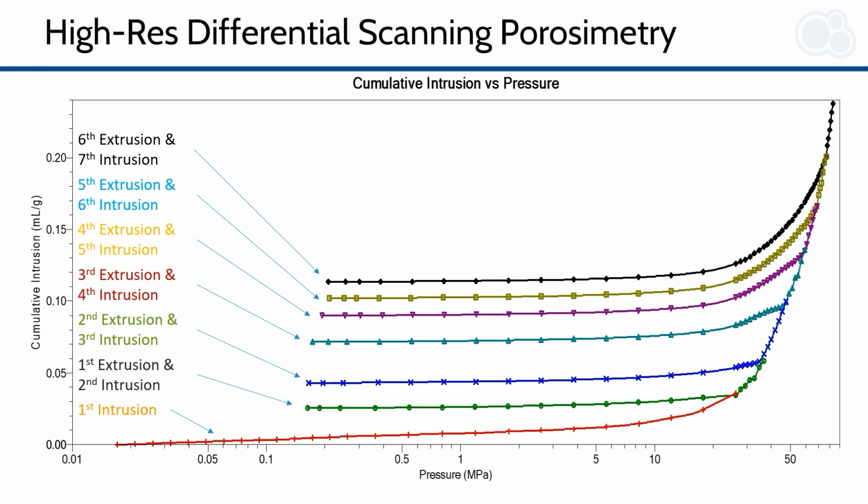It is the intrusion pressures and corresponding window sizes that give us the cavity volume distribution as a function of pore window or throat size. For the pore volume of the throats, it is simply the total new volume intruded less the volume assigned to the cavities. We are not necessarily finding the cavity sizes, but rather the volume of the cavity filled as a function of throat size and a separate pore throat distribution.